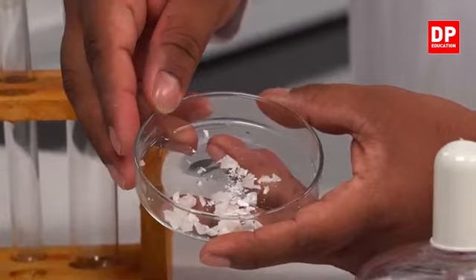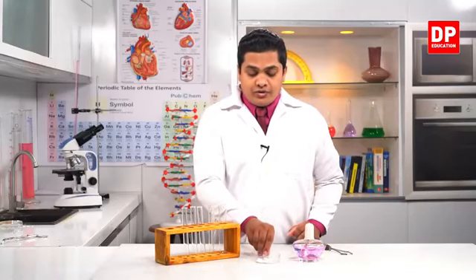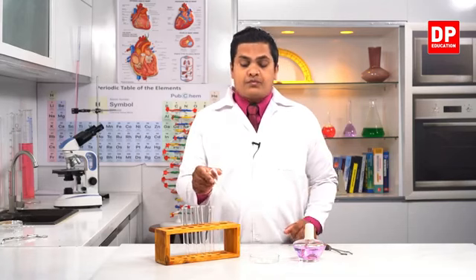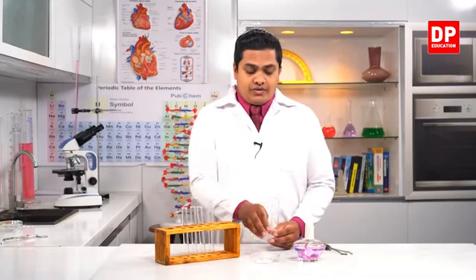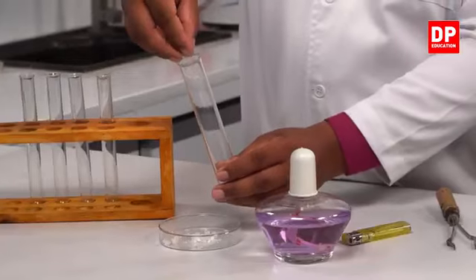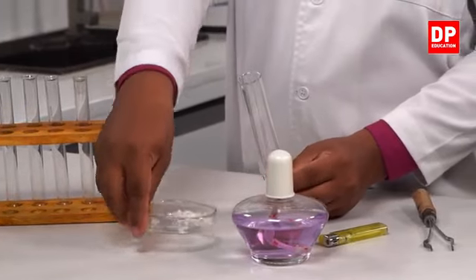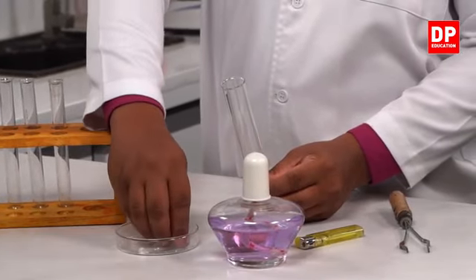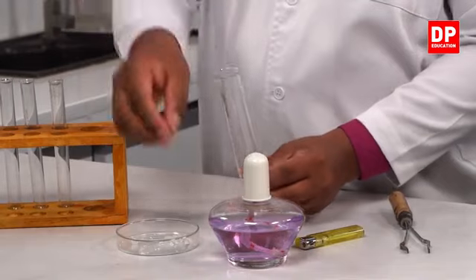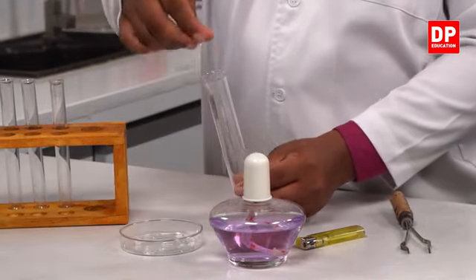Now what I'm going to do is take a boiling tube and insert these wax pieces into the boiling tube gradually, and I'm going to heat it by using the spirit lamp over there.